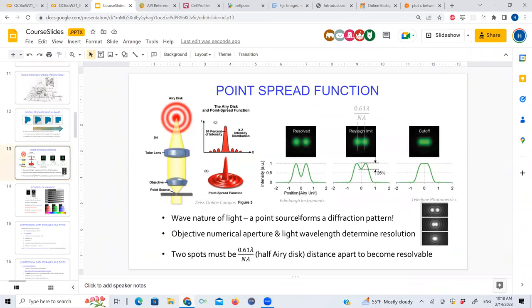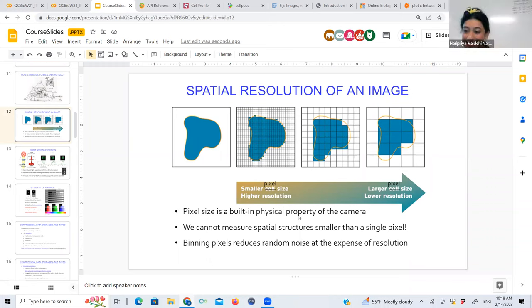I have a quick question or two. Is this similar to doing a Gaussian blur on the image in order to remove the edges a little bit? So you are on the right track. We do Gaussian blurs to improve noise properties at the expense of image sharpness, absolutely. And we're going to go into that in detail tomorrow. And the reason we do Gaussian blurs is also because noise is Gaussian. Yeah, you're on the right track.